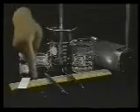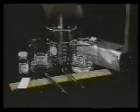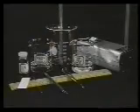The equipment required for this technique includes your sample, the TLC plate, a micropipette, a solvent to dissolve your sample, a developing tank, solvent for the mobile phase, tweezers, a method of visualizing the developed TLC plate, in this case an ultraviolet lamp, and a ruler and a pencil.